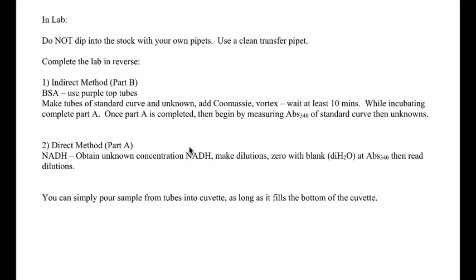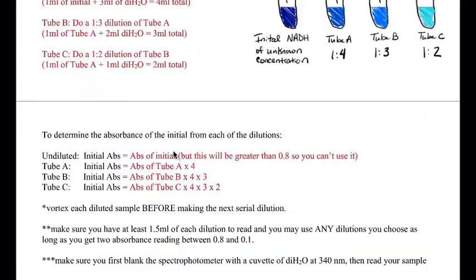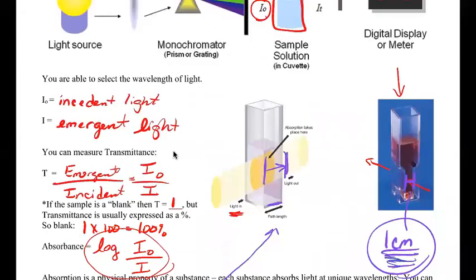And the other thing is to be very, very careful about what wavelength you're using for which sample, right? And then you're going to have a test tube that's going to have whatever sample in it, and then you're going to have your cuvette, and I'm a really terrible artist. I can't really draw that, but you don't actually have to pipette it. You can actually just pour until you make sure, if I come up to the top, that when you pour, you go above this line right here.